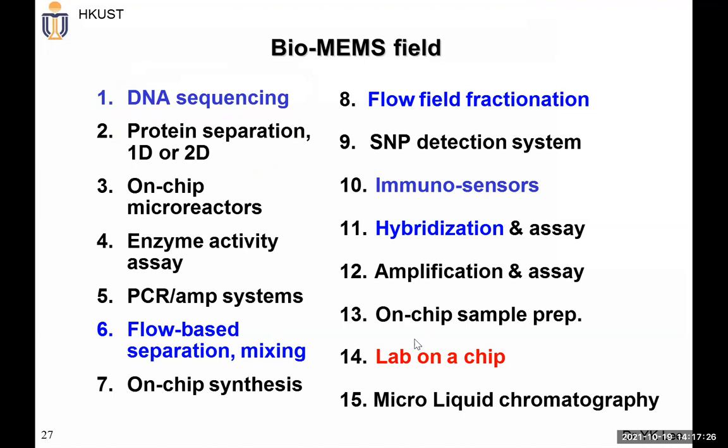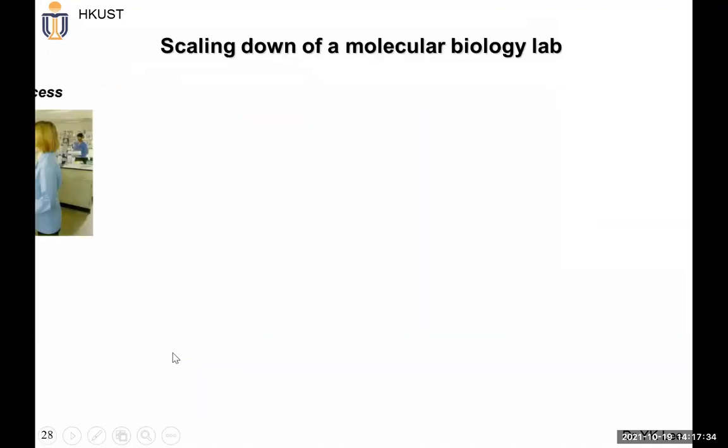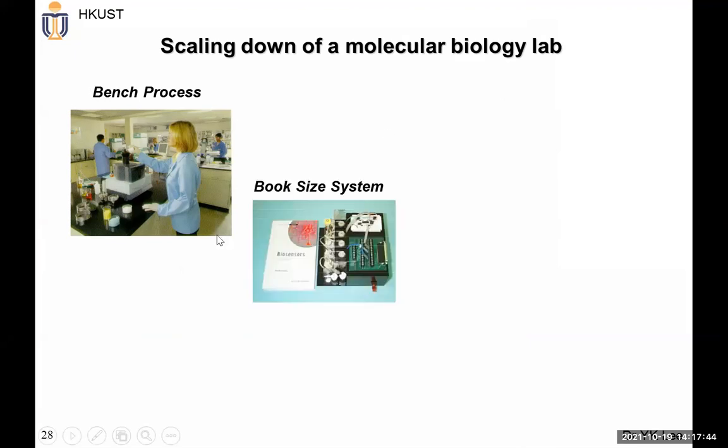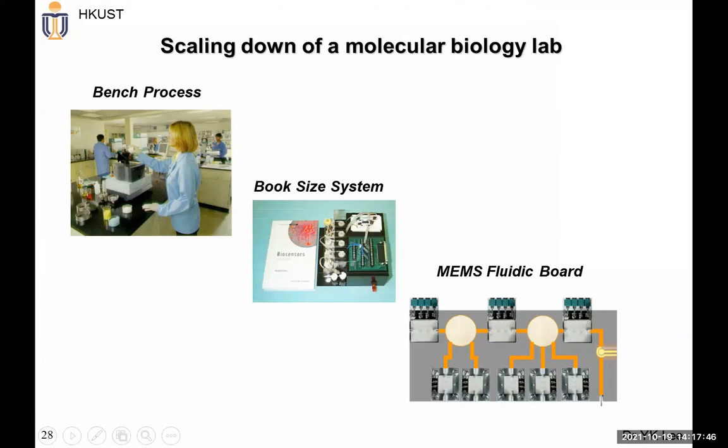Of course, eventually in the near future, we would like to do lab-on-chip integration, right? Last time we also quickly mentioned this. Basically, for microfluidic devices, once you make them smaller and smaller, with a good design, you can really scale down a lot of very time-consuming benchtop processes into, for example, a microfluidic chip or microfluidic device. What happens?